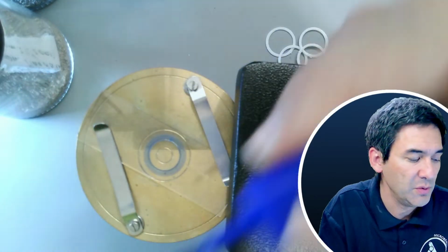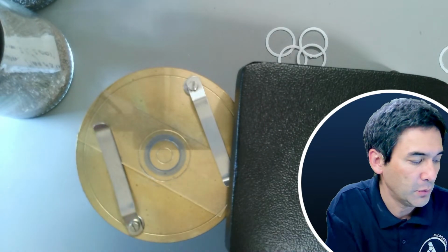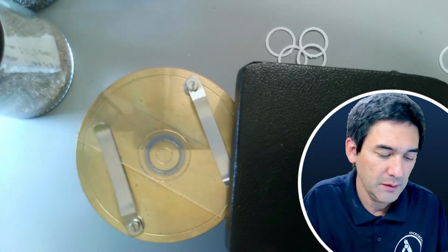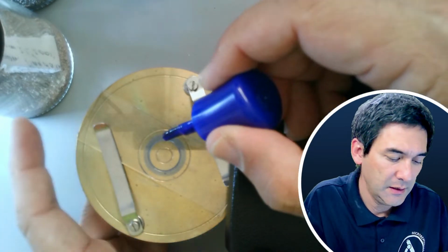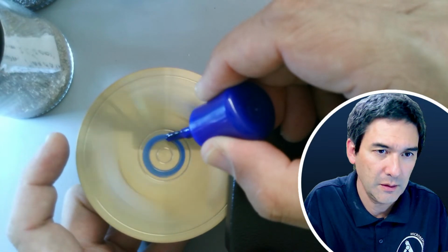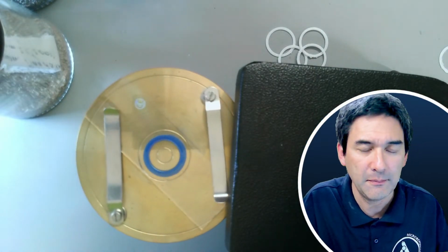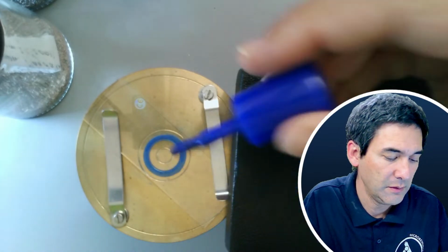What I do is I allow it to dry a little bit. I think maybe I'm going to try the other bottle. Maybe this one over here is a little bit more liquid. I don't know. And I'm a little bit off center as well. So let's see if this works better. Okay, and I'm going to apply the second layer now. I give it again a couple of minutes drying time. Third layer.